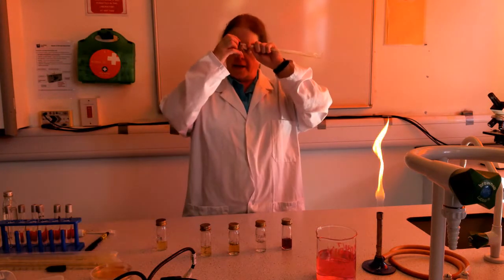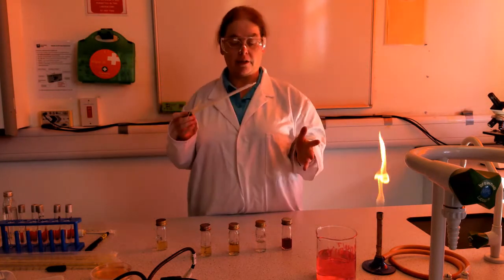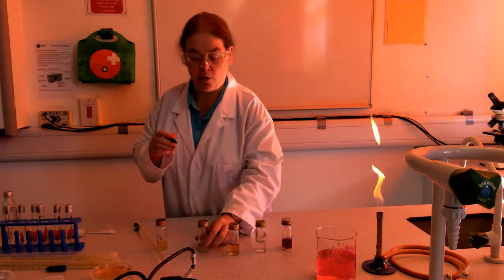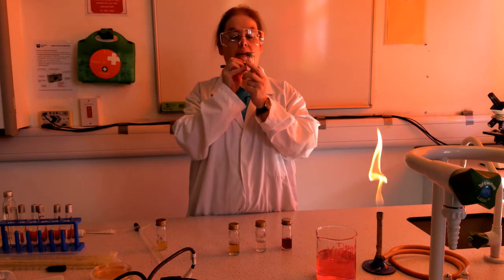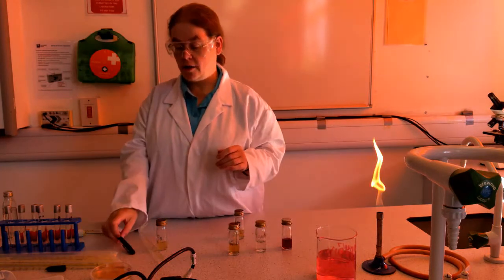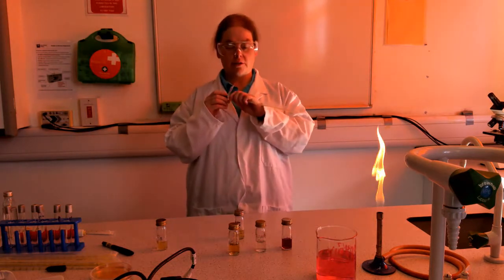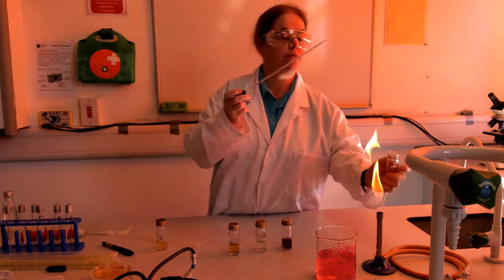And what I would normally get you to do is put 0.1 millilitres of bacterial culture into each of these. So obviously you would need to label it with your name, the date, and the bacterium, so that we know, as we've discussed, who is responsible for the culture. So what I will do now is take out my sterile pipette using the correct technique that we've talked about.